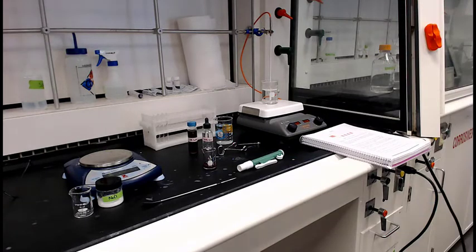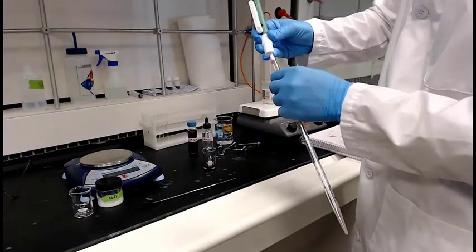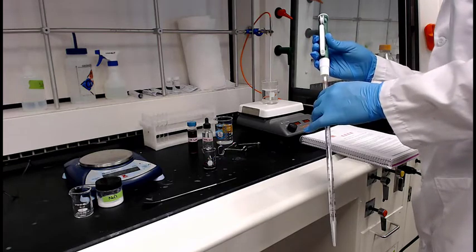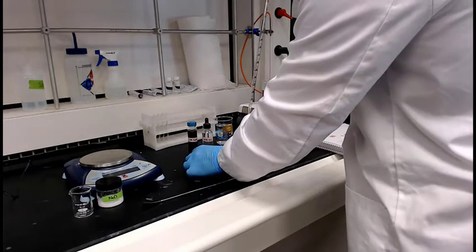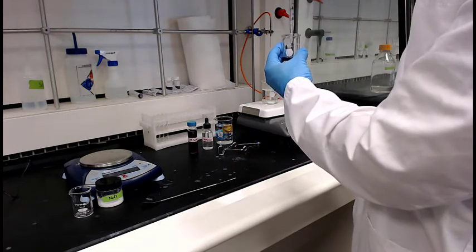So step 3, split the solution into 3 test tubes. We're going to have a 1/2 mil, 2 mil, and 2.5 mils. So if you do the math on that, that's where our 5 mils are going to go. And again, we're going to mark them 1, 2, 3. Test tube 2, the one that has 2 mils in it, that's going to be our color reference. So anything that happens from here on out, we'll be able to reference it to color 2.